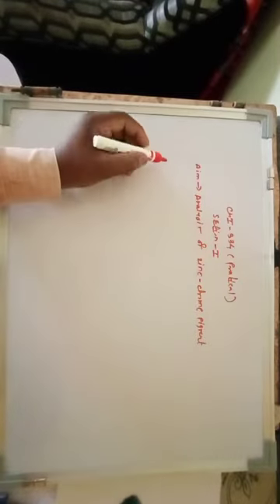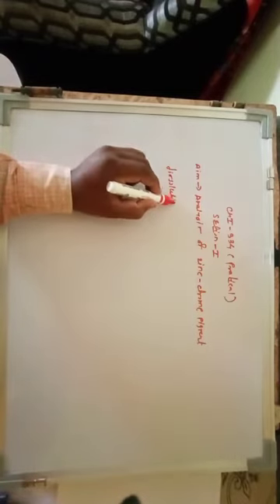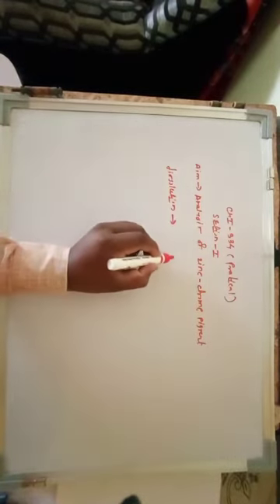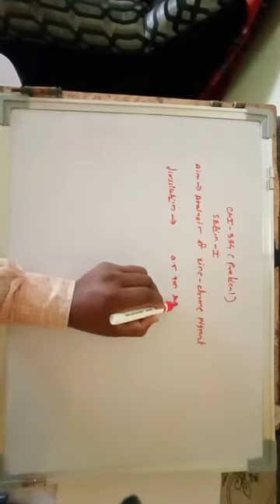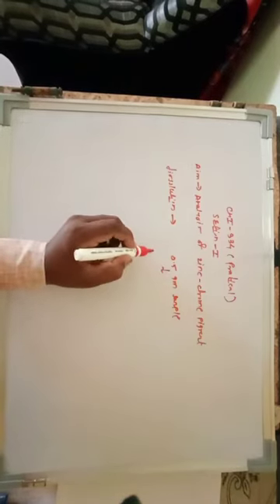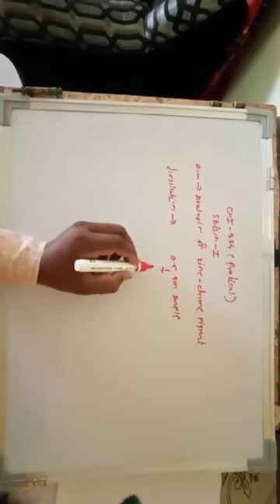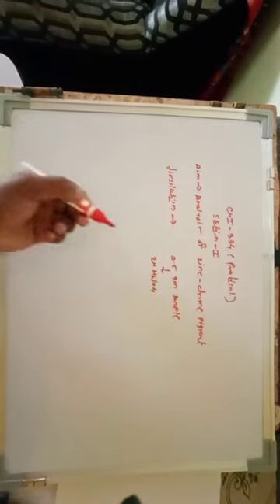If you consider the dissolution procedure, you have to take a 0.5 gram sample of the zinc chrome pigment and dissolve it in a 2 normal H2SO4 solution. If it is not dissolved, then you have to use the concentrated solution.